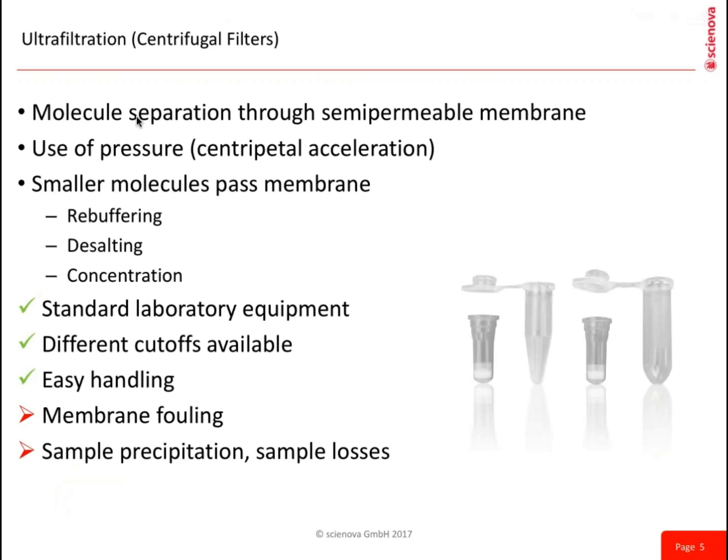The second method I want to talk about is the ultrafiltration. This separation takes place through a semi-permeable membrane under the usage of pressure, for example, in a centrifuge. It's a commonly used method for desalting and rebuffering, and for concentration of samples too.